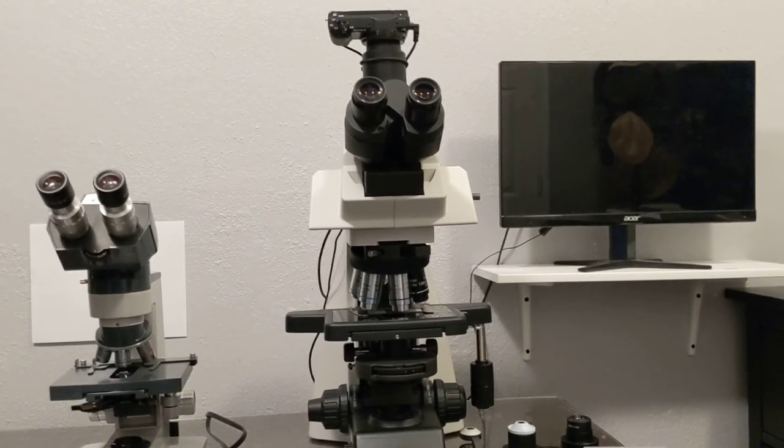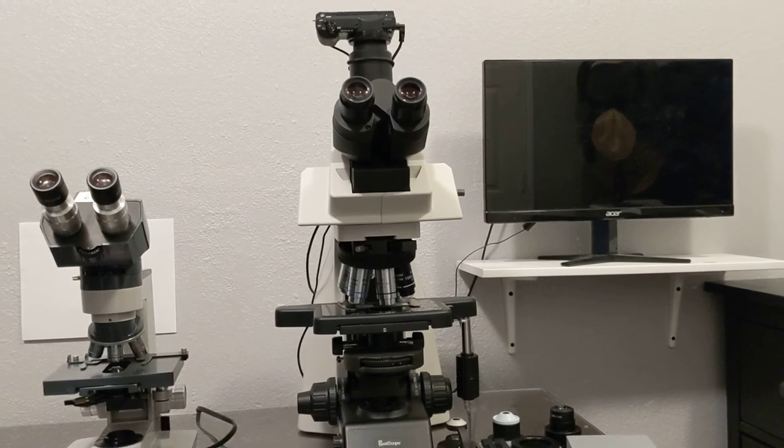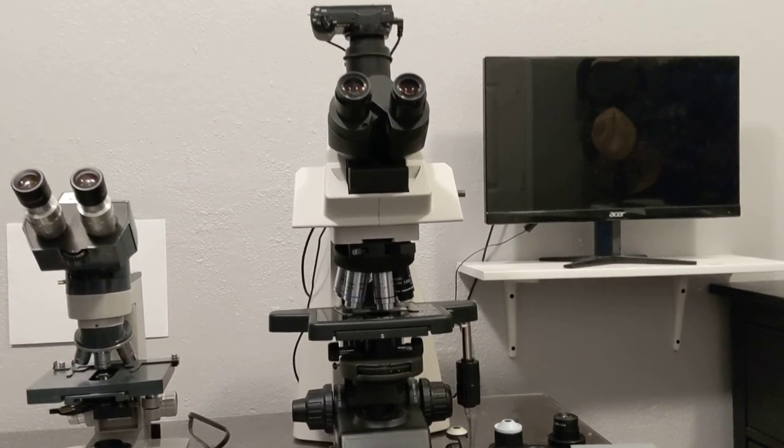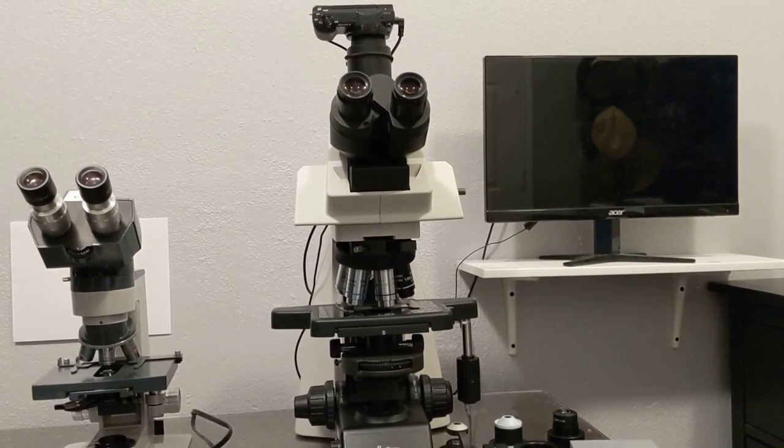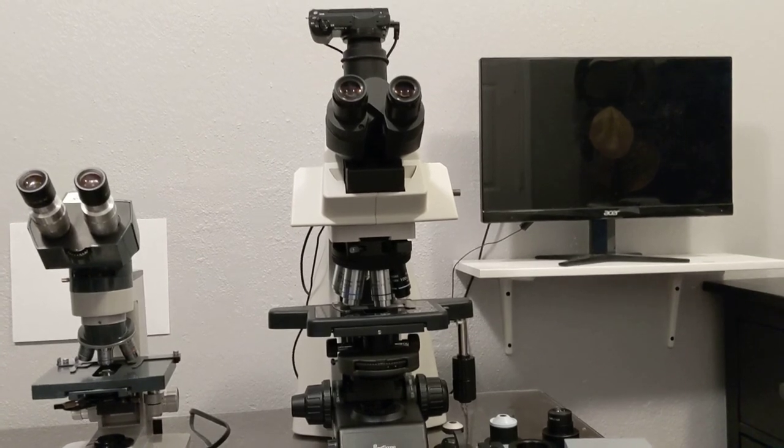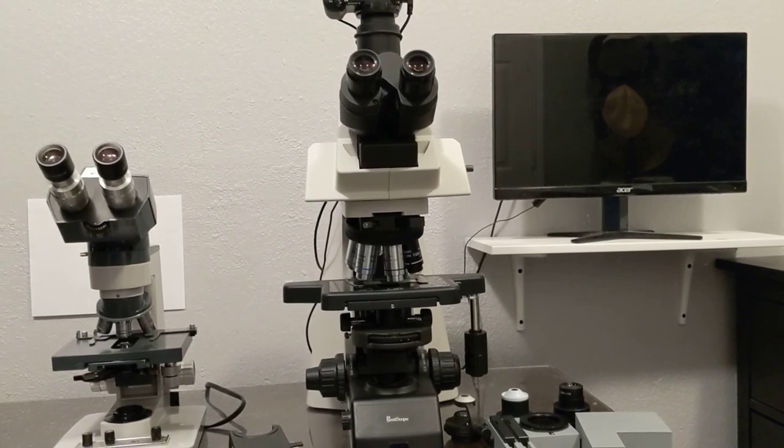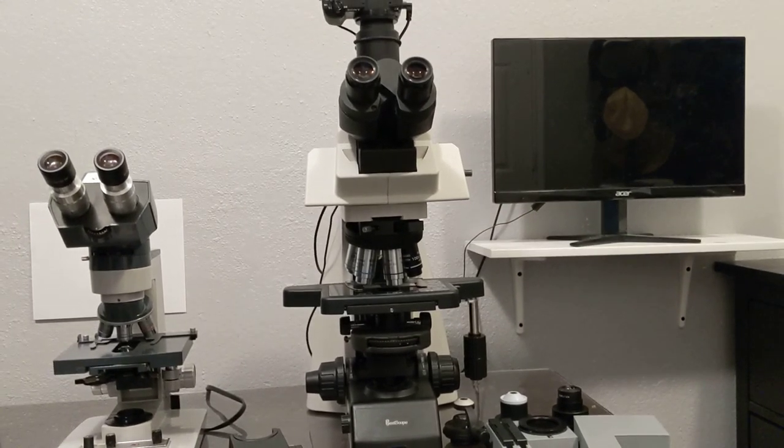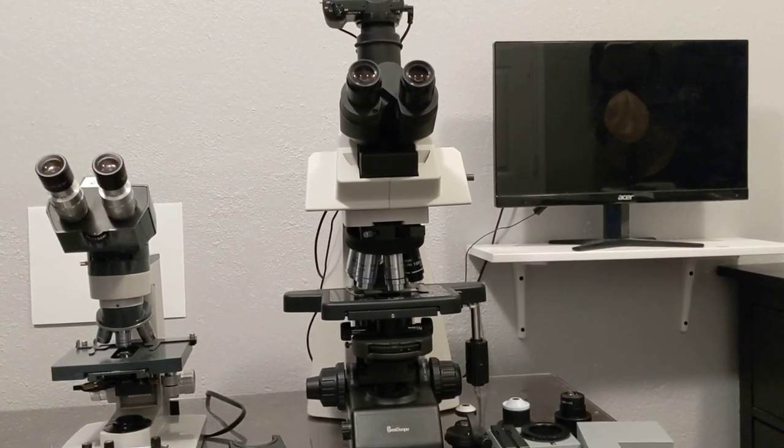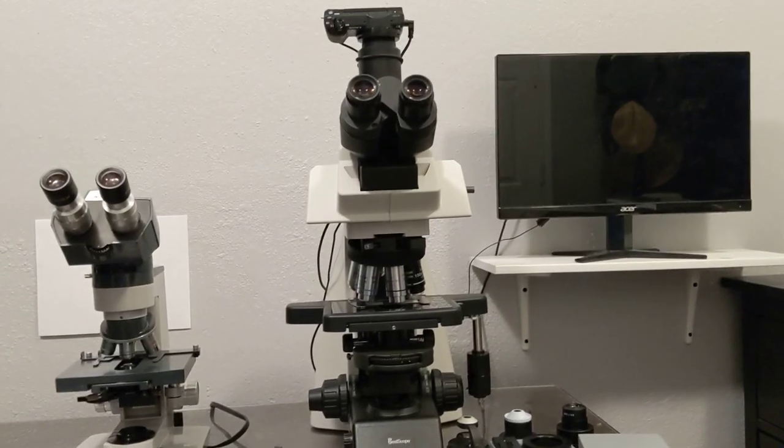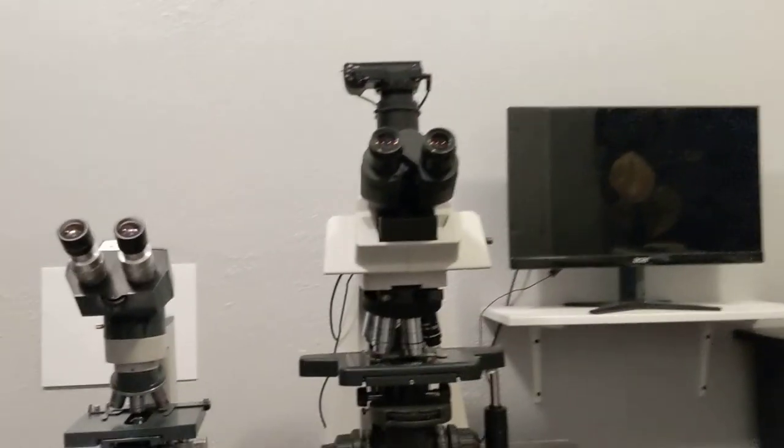If you're going to buy from Best Scope in particular, you need to double and triple check everything and make sure that there's no misunderstandings. But overall, you can't complain about this quality of microscope at the price that I got it. Nothing was broken or misaligned or of poor quality. The DIC system works good. The objectives are all really clear and really good, really well aligned. Everything's really well-centered even. No complaints about that stuff. Great performing microscope.